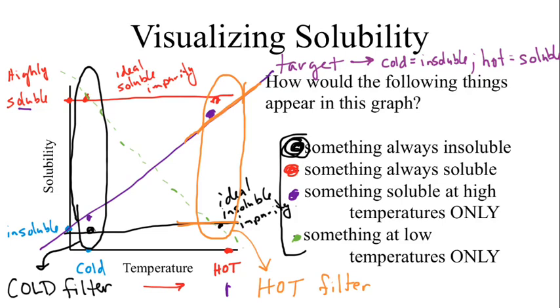Okay, I know there's a lot on this curve. It's a lot to deal with because it's a lot of new information, but I'm going to go ahead and make it even more difficult. What happens if our impurity happens to be this blue line?